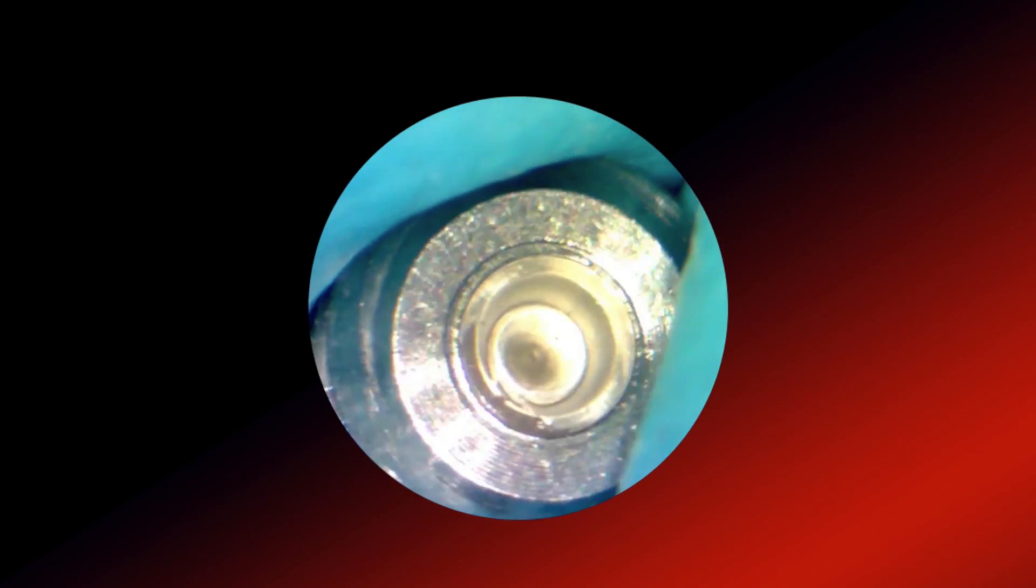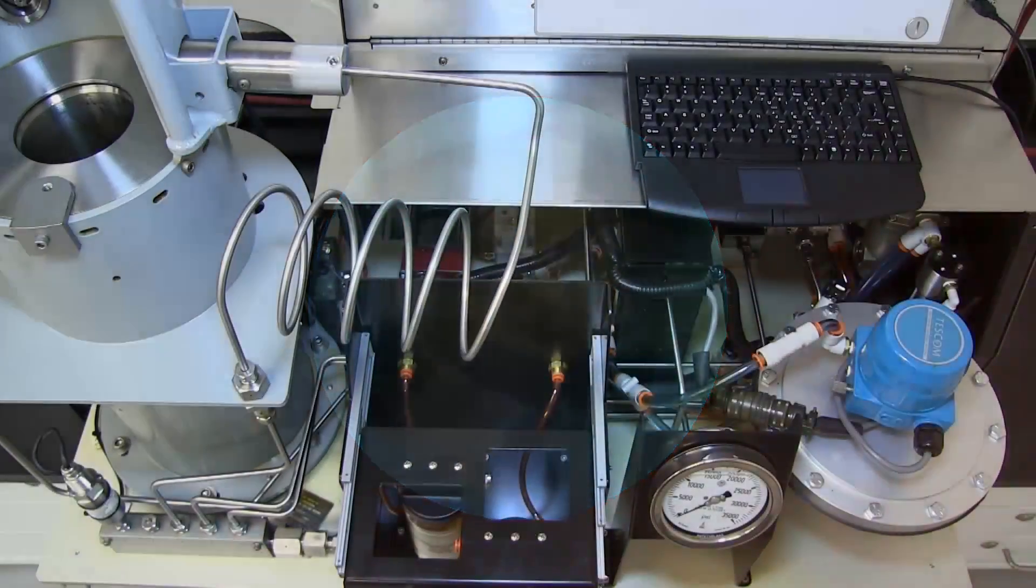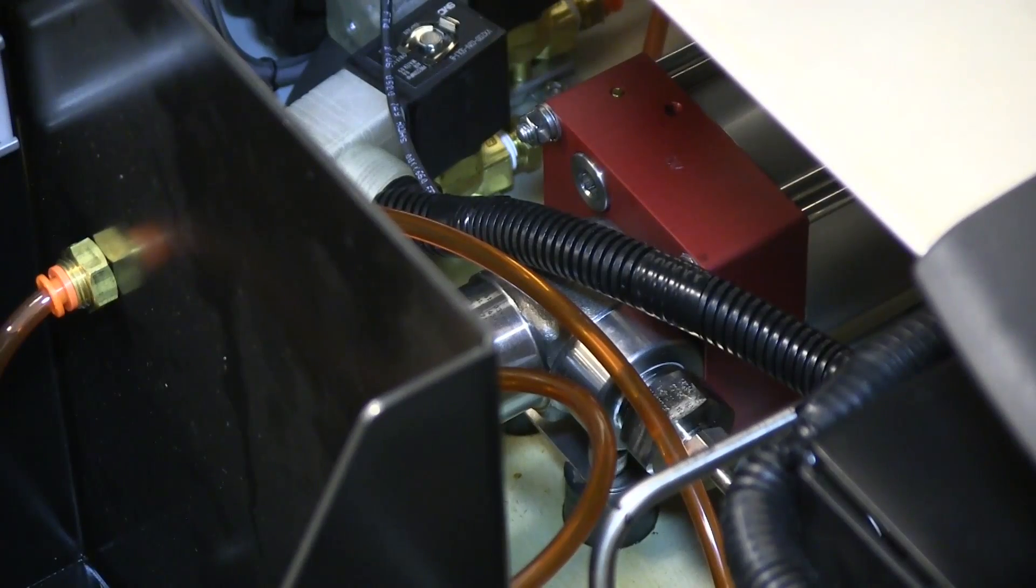Test pressures are generated by an air-operated high-pressure hydraulic pump and controlled by a smart back-pressure controller.